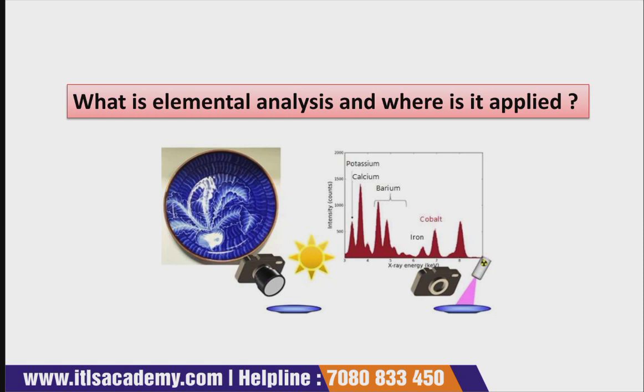One word I am using again and again is elements. Elements are very critical for the quality as well as the safety of any material, and they are present in a very low concentration. If you talk about the elements, they are present in a very low concentration, so it requires highly sensitive instrumentation for the determination of elemental composition. So what are the different types of instrumentation? For example, X-ray, absorption, inductively coupled, etc.